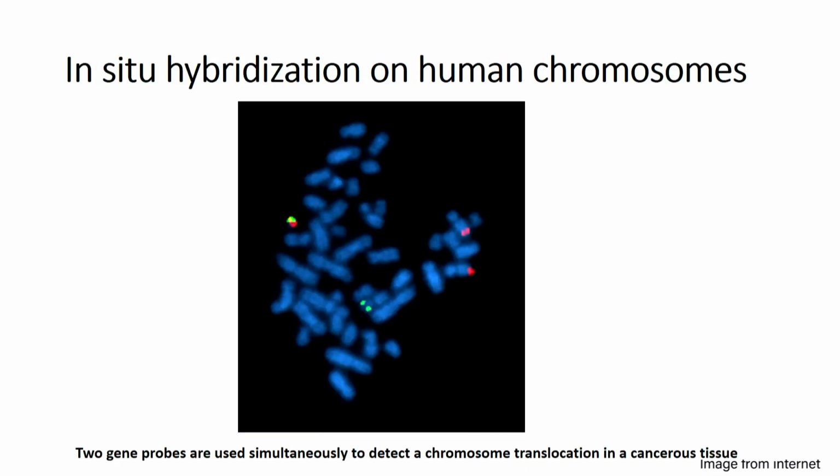Okay. Can we do this? This is the earlier one, just now we showed, that is RNA in situ hybridization. That means the expression of a gene is being traced. Now, can the hybridization be done on chromosome to localize, let us say, a gene? Yes. So a probe has to be specific for a given gene. Here, 2 gene probes are being used.